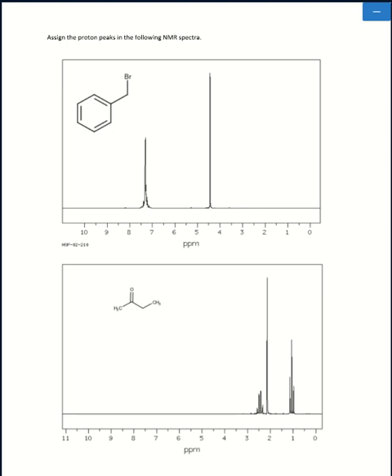Basically, nuclear magnetic resonance spectroscopy. There are many different types of NMR, some that will only give you information on the different kinds of carbon environments, some that will tell you the different kinds of fluorine environments. The one most common and very effective is proton NMR, which is what you're looking at. These spectra all belong to proton NMR, where it is analyzing the different environments of hydrogen.